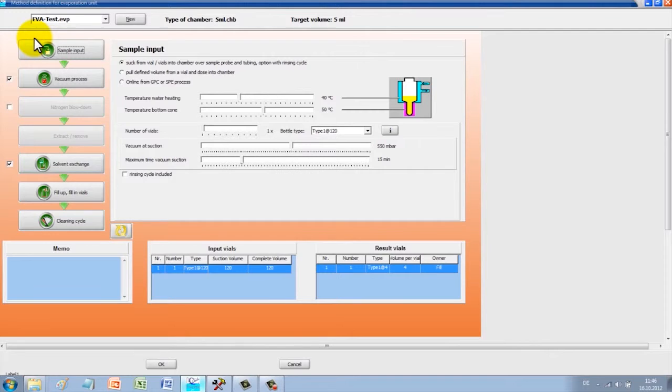How do you set up a method quickly? The method is predetermined within the structure and divided into sample loading, vacuum process, blowing off with nitrogen, removal, solvent exchange, filling, and cleaning.